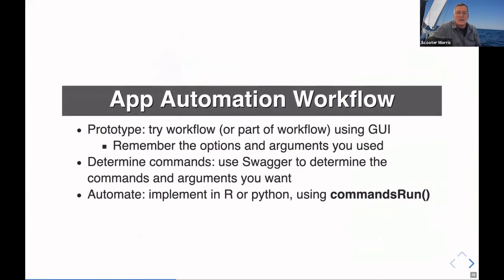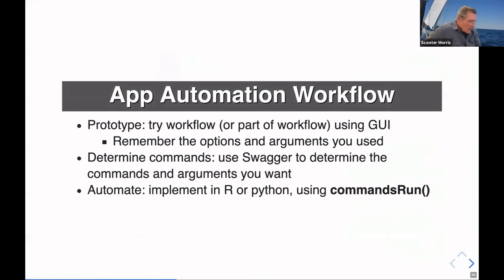So in thinking through this, one of the things that I like to really think through is, if you're going to automate something, how do you go about it? So my recommendation in particular, unless you're really an R guru and R just flies from your fingers, is that I would always recommend that you do the part of the workflow that's going to use Cytoscape using the GUI.